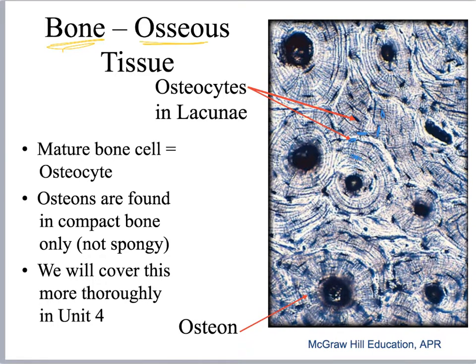The lacunas around it, because of the staining, you can't really differentiate them, but those are there. All right, this is where, change color. These things right here, this is where you've laid down mineral. So the ground substance, all right, is actually minerals, in this case, calcium, phosphorus, and magnesium, okay?